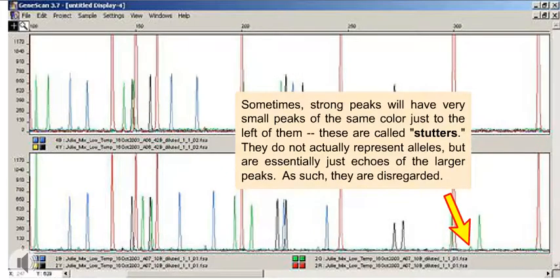Sometimes, strong peaks will have very small peaks of the same color just to the left of them. These are called stutters. They do not actually represent alleles, but are essentially just echoes of the larger peaks. As such, they are disregarded.